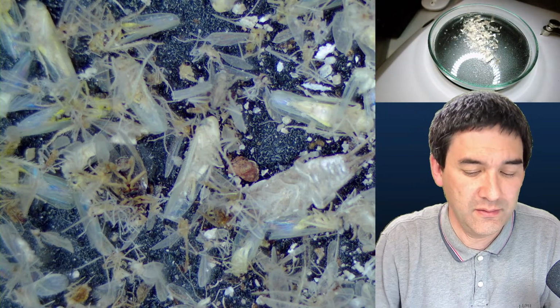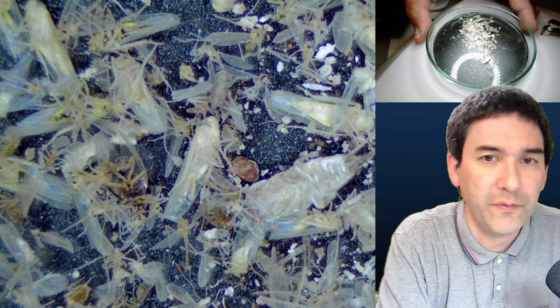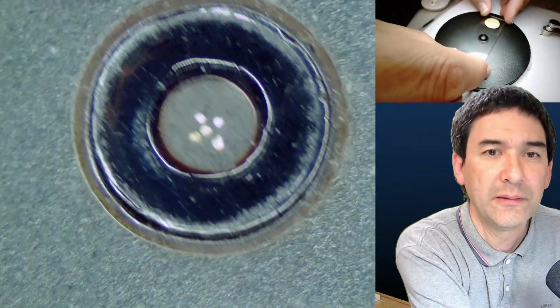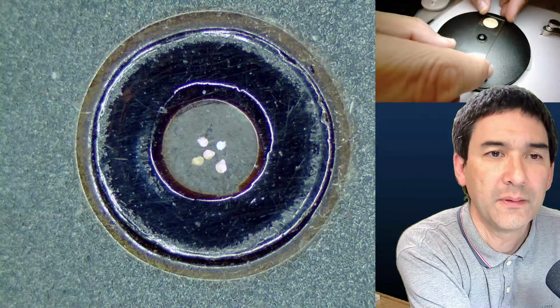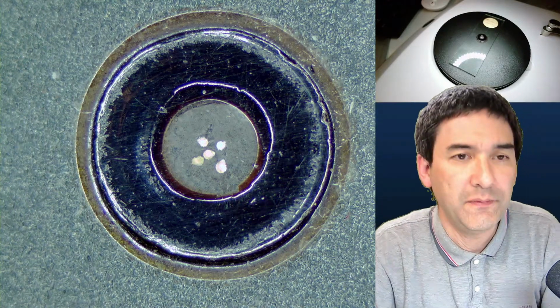Simply to wrap up a little bit of last week's activity. Let's remove this here, and this slide goes here. You see these 5 dots on here. The magnification is still quite low.